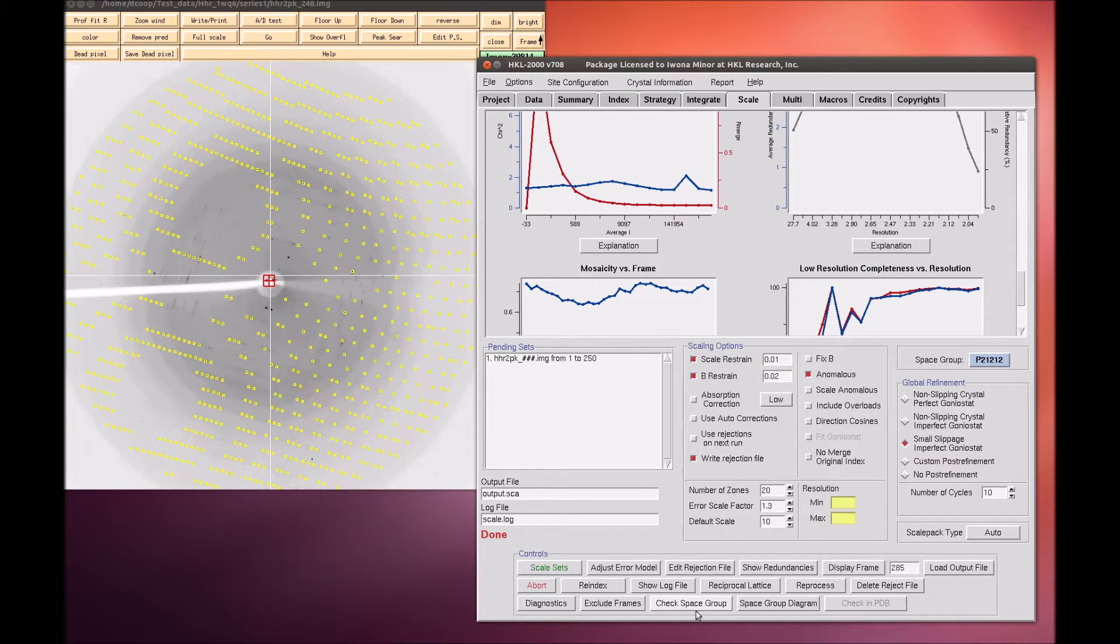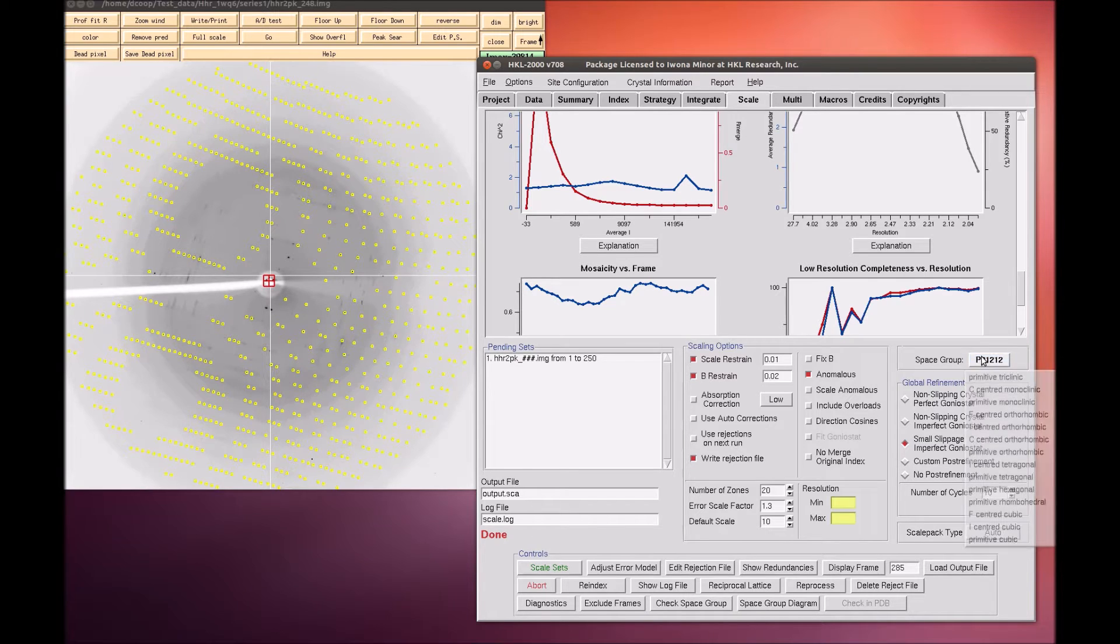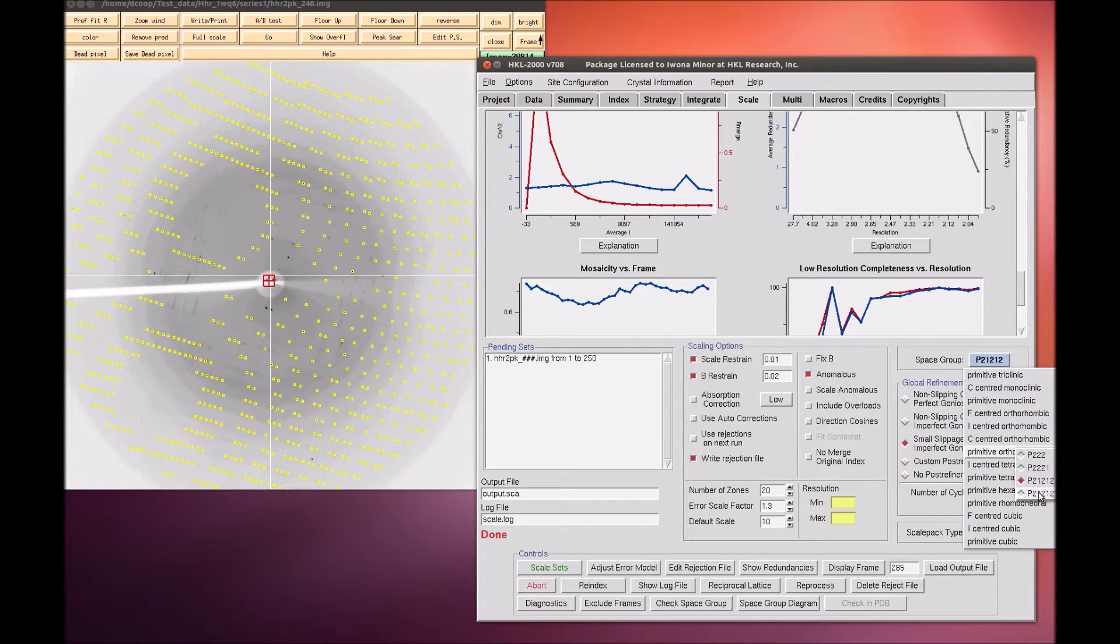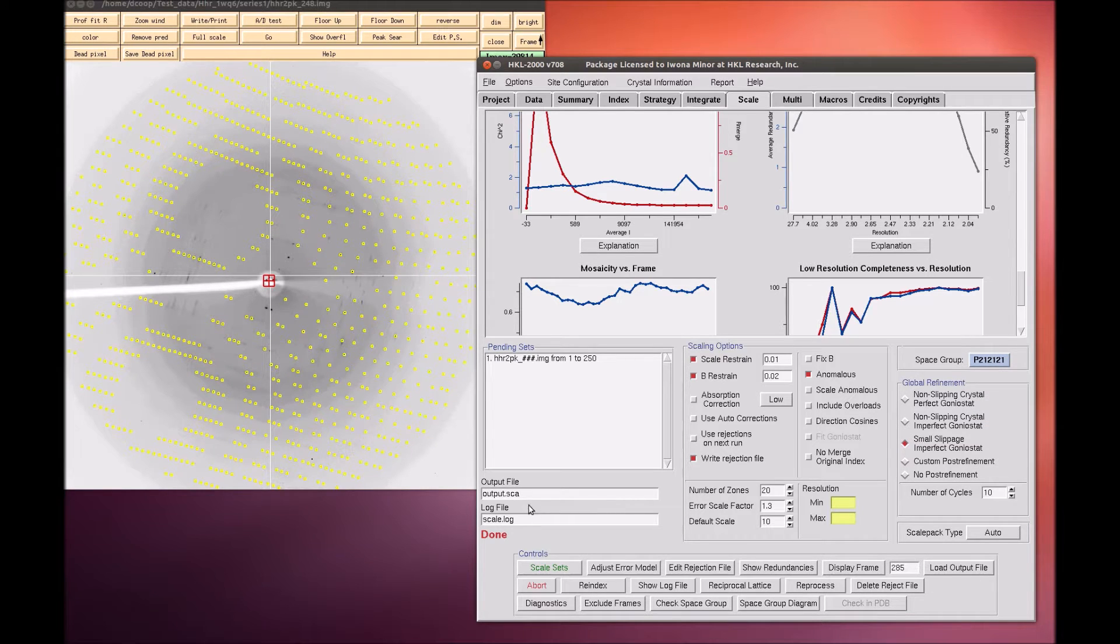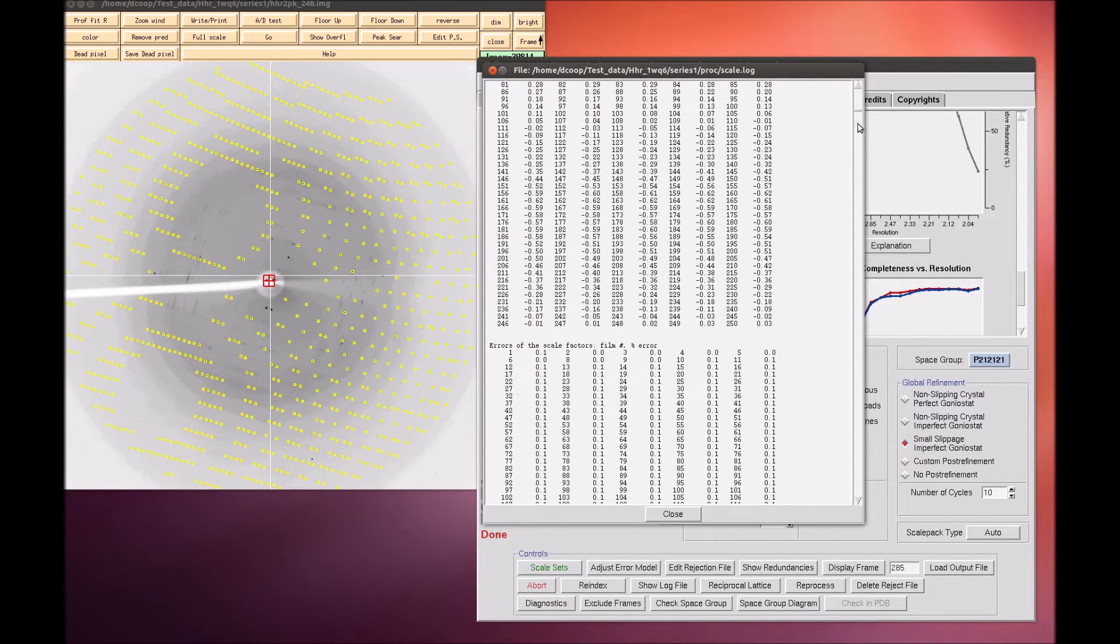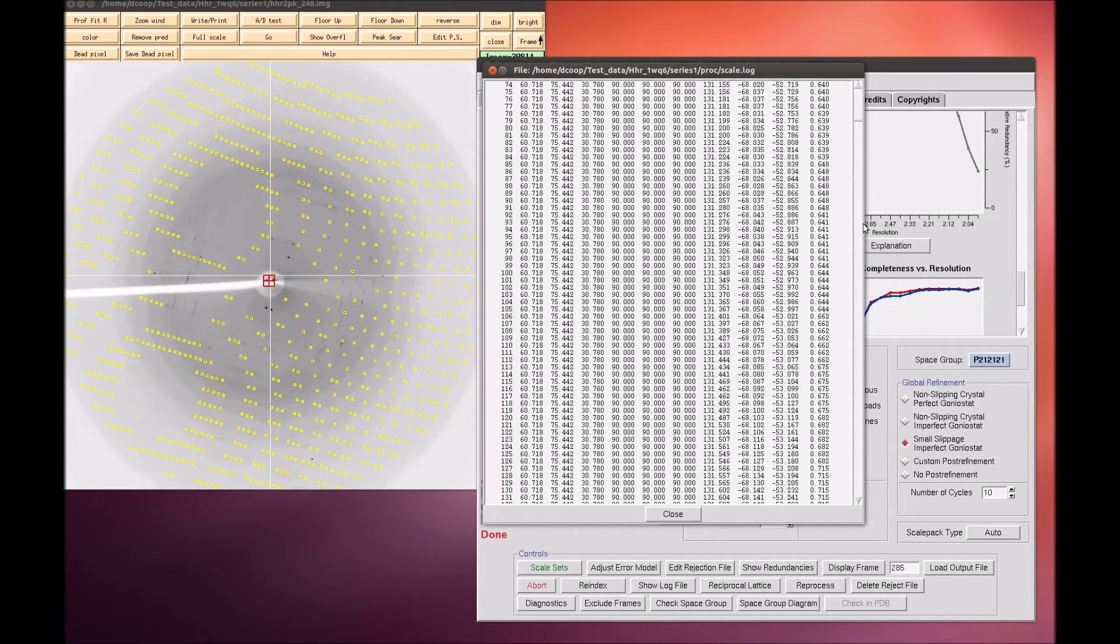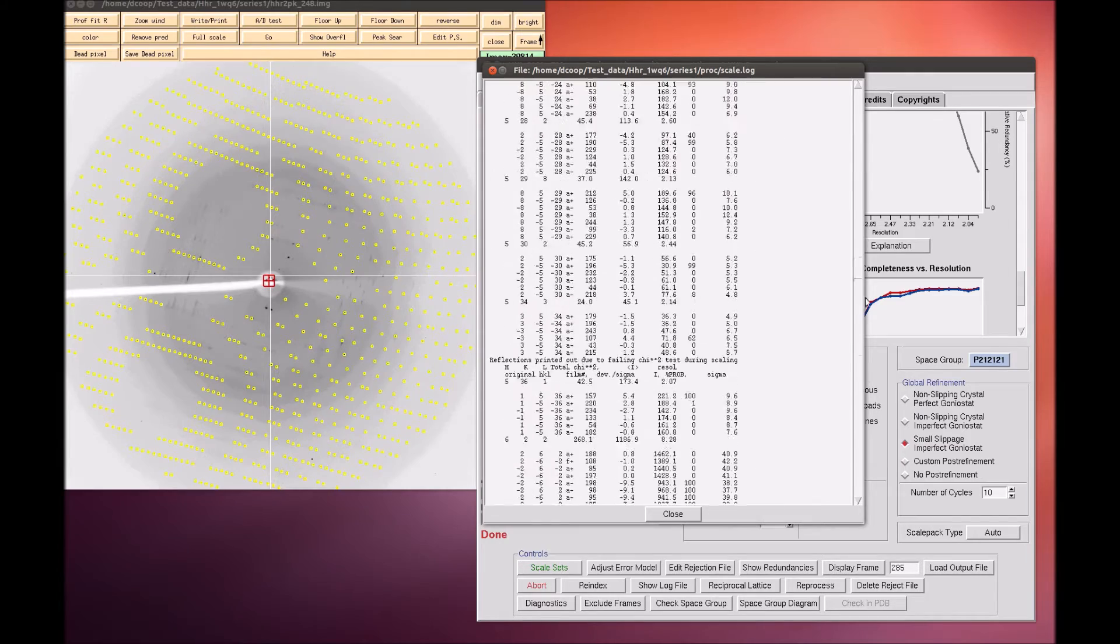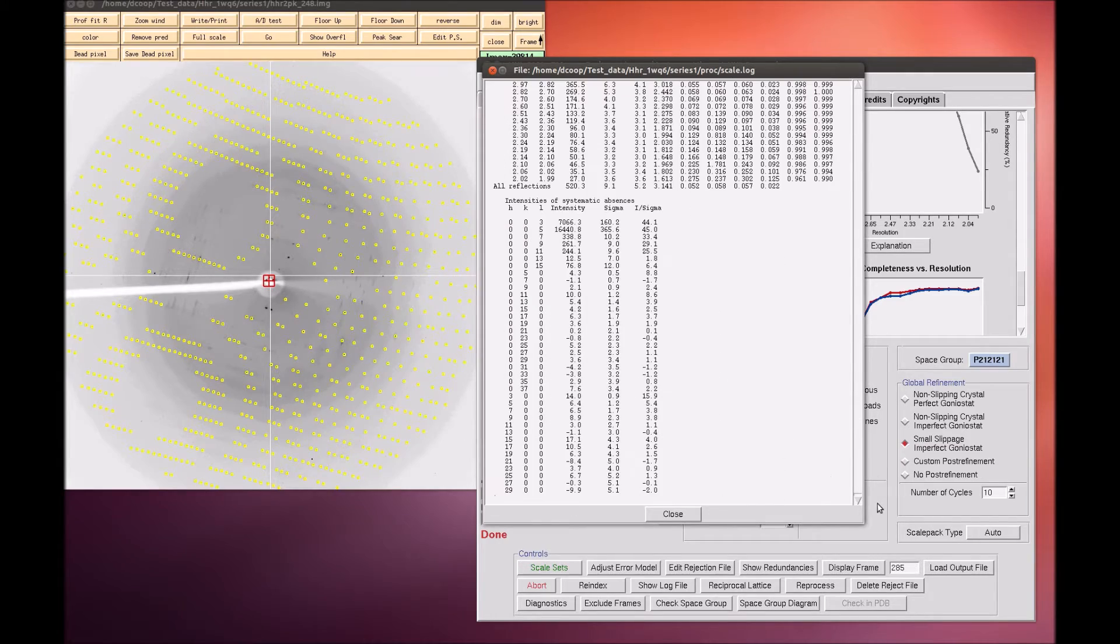If your version of HKL is not linked to CCP4, the Check Space Group button will not work. In this case, scale the data in P212121 and examine the log file. You should see that one axis clearly does not have a screw axis. If this axis is not on the L axis, re-index the data.